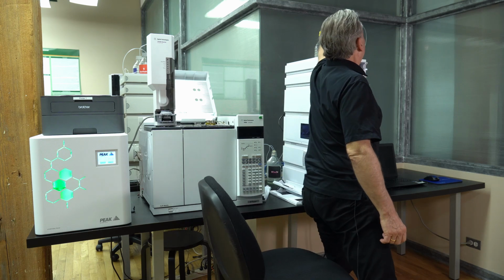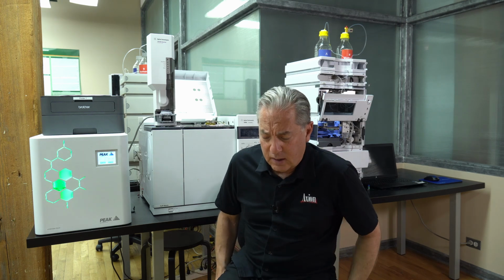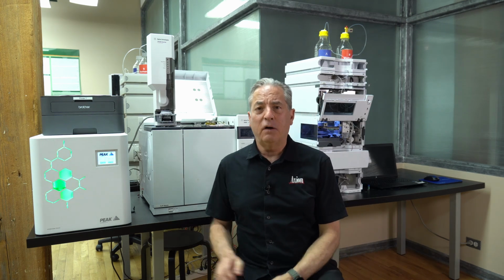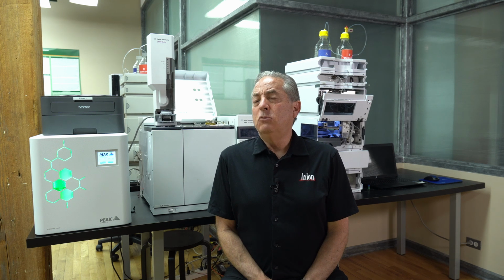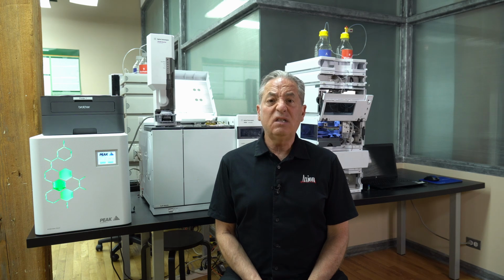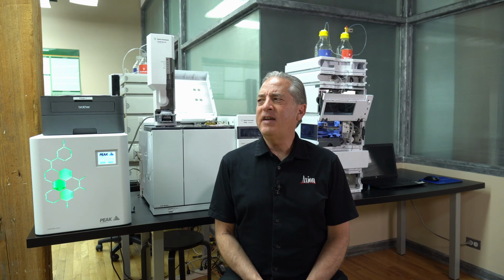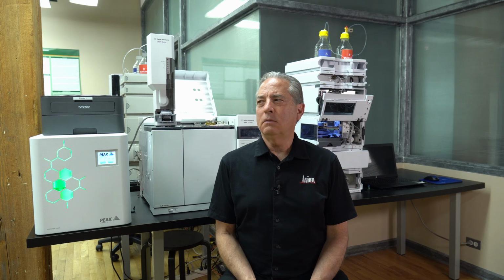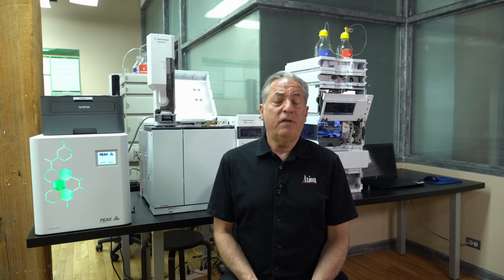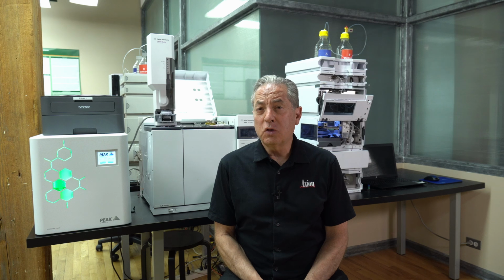And that little thing right there is a little vapor cartridge, and what it does is it captures the organic compounds that are coming off the bottle itself. Most labs I've worked in do not use those, but it's something easy that you can do, especially on the waste containers. Consider doing that. I find that most labs' ventilation has so many air turnovers that we're not going to notice that. I have a very sensitive sense of smell, and I am hard pressed to ever smell methanol or acetonitrile in our lab. So those are the safety precautions.